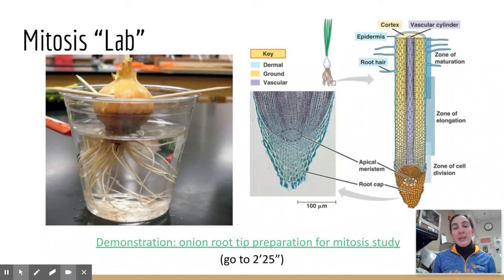So write your experiment, design it, think about all of your constants and your variables and all of that, but have it be based on counting the number of cells that are in mitosis.